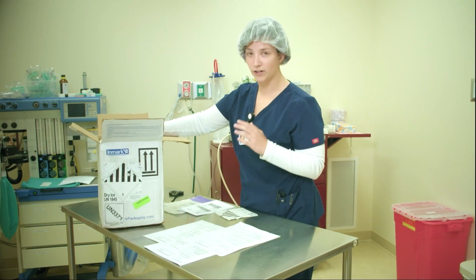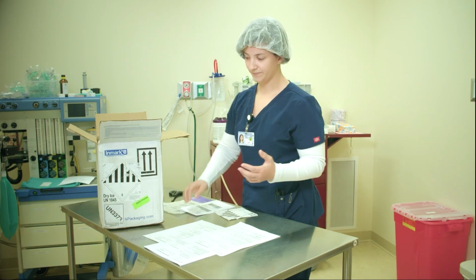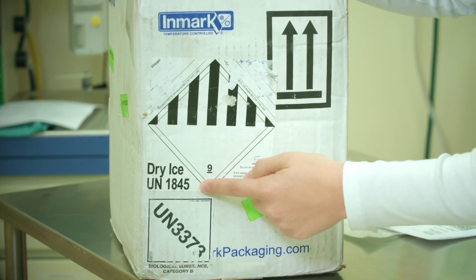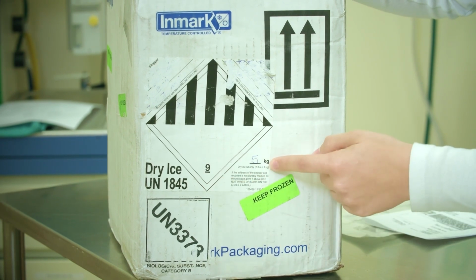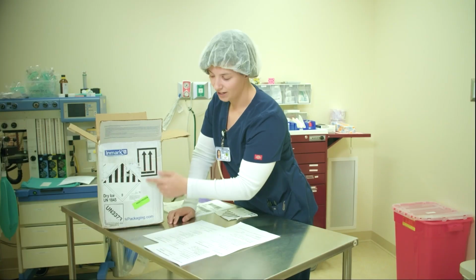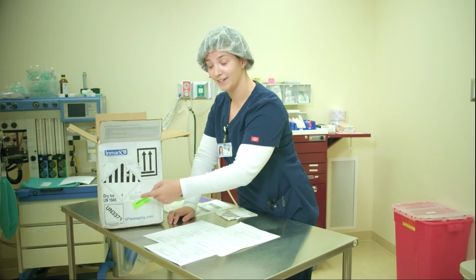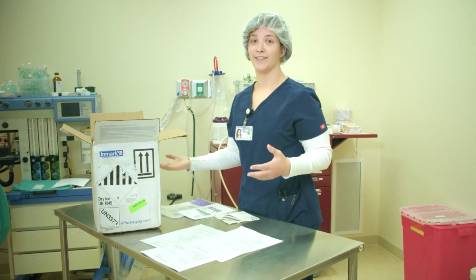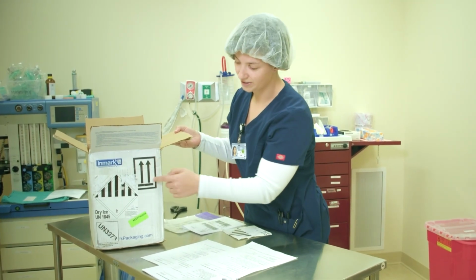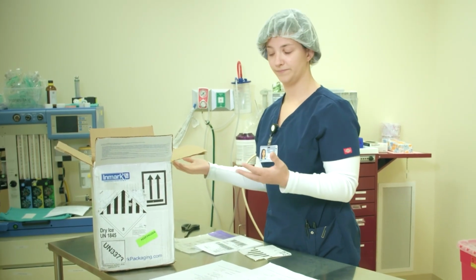Your box has to have a couple different types of stickers on it to travel with biohazardous substance. First, you want to make sure you have the dry ice UN 1845 sticker. On this sticker will indicate how many kilograms of dry ice you have, the shipper, and where it's going. You also need a UN 3373 biological substance category B sticker. This tells whoever's carrying it that there's a biohazardous substance in the box. You also need up arrows, letting the courier know and the receiver know which side is up.